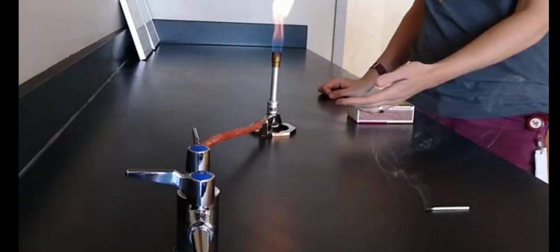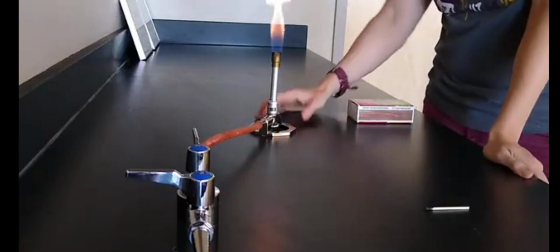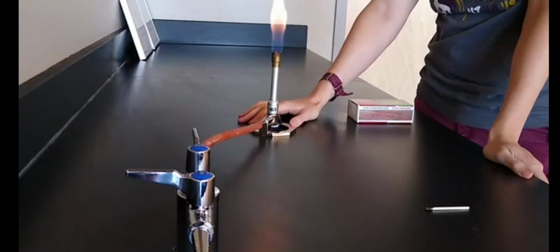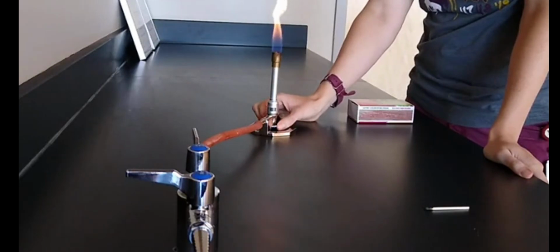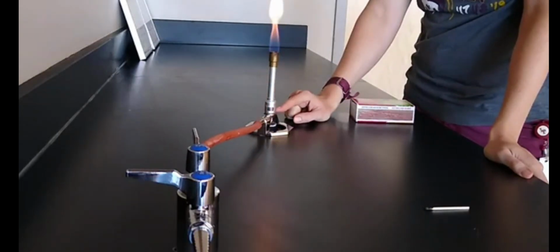All right, now we have our Bunsen burner lit, but it's not properly adjusted at this point. The purpose of the Bunsen burner is to create a very stable high temperature flame, and an orange flickering flame like this one is not stable. So first off, this is too tall. I'm going to use the valve on the bottom to decrease the height of the Bunsen burner flame. Then I'm going to open up these air vents.